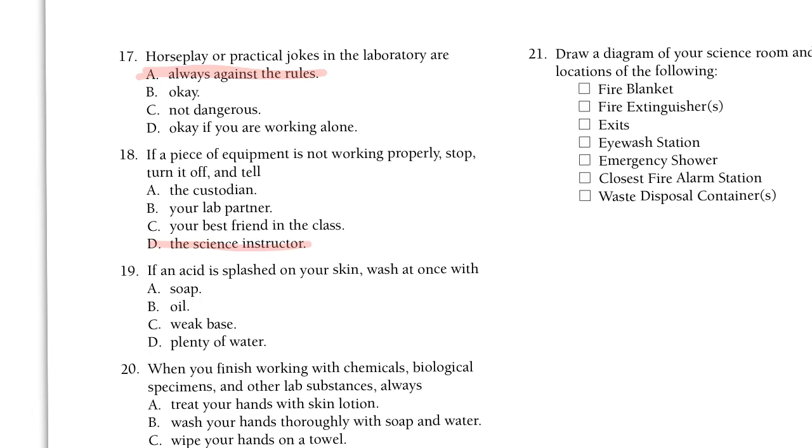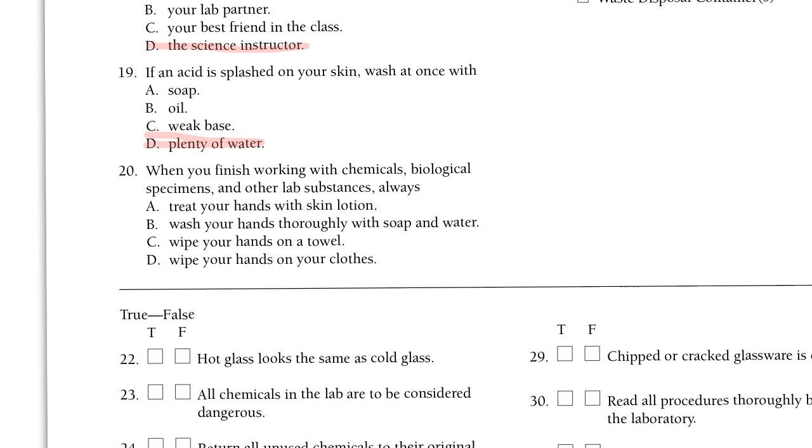If an acid is splashed on your skin, wash it at once with soap, oil, a weak base, or plenty of water. What? Actually, the answer is plenty of water. Have you ever used a shower before? Not the shower. Eye wash station.